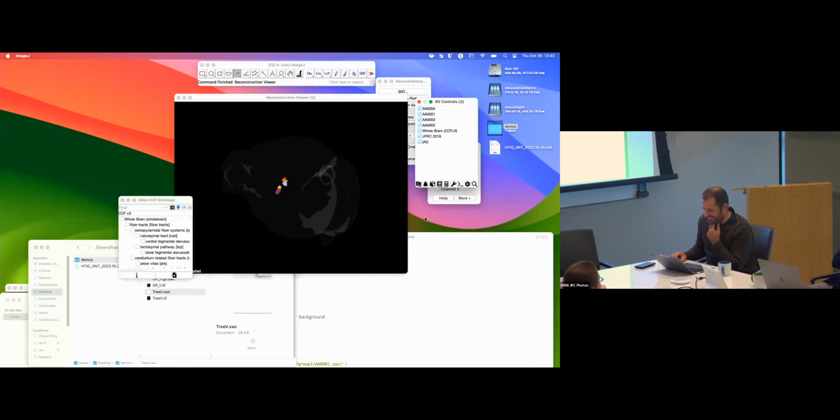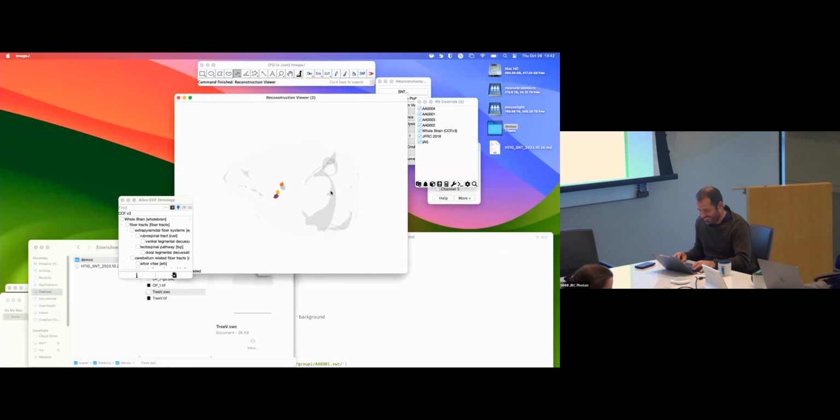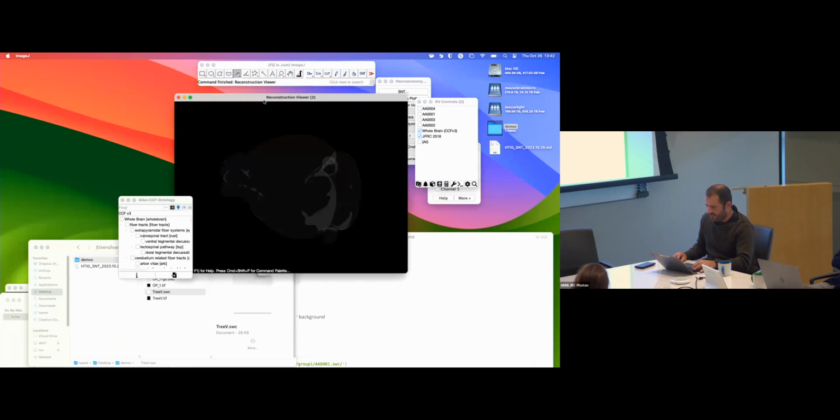Is that your brain? That is just my brain. There's a little fly inside here controlling everything. Yeah, I always love to do this. That's the fly brain right there. Oh, it's very bad on the screen. This looks like crap here, but do you see that dot there? That's the fly brain, that's the mouse brain. And we can load the zebrafish brain too. And that's that bigger dot there.